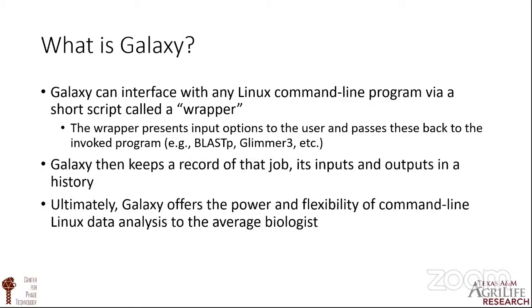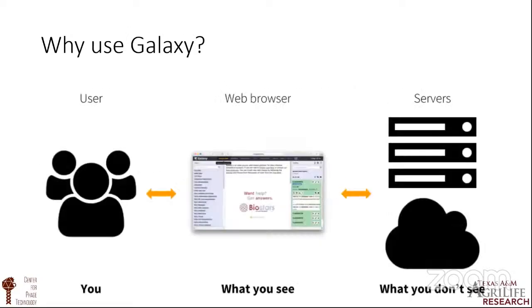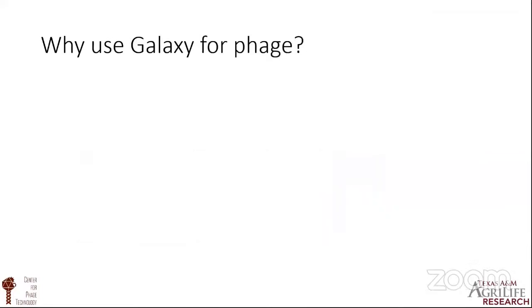So why use Galaxy? This is a simple diagram illustrating some of the benefits to the user for using Galaxy. On the left is the user, which is you. And what you see is just the web browser interface for Galaxy, and what you don't have to see or manage are the server clusters, the cloud computing infrastructure, or the complicated command line interface and file management for your tool inputs and outputs, as those are all managed and organized by Galaxy.